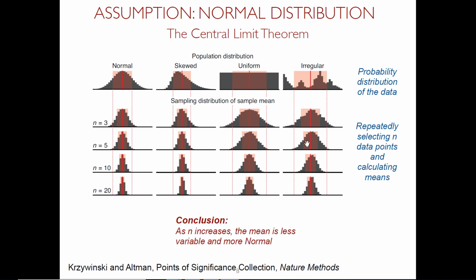Yes. And the reason is because comparing protein 1 to protein 2 for the same patient, well, there are too many differences, right? Including ionization efficiency, including the digestion and all of that. So if you really want to compare abundances of proteins within the same patient, well, either you do absolute quantification, right, so that it really relates to the true values, or you have to do other things to make things comparable. So for the moment, I'm really talking about relative quantification for the same protein across multiple replicates.